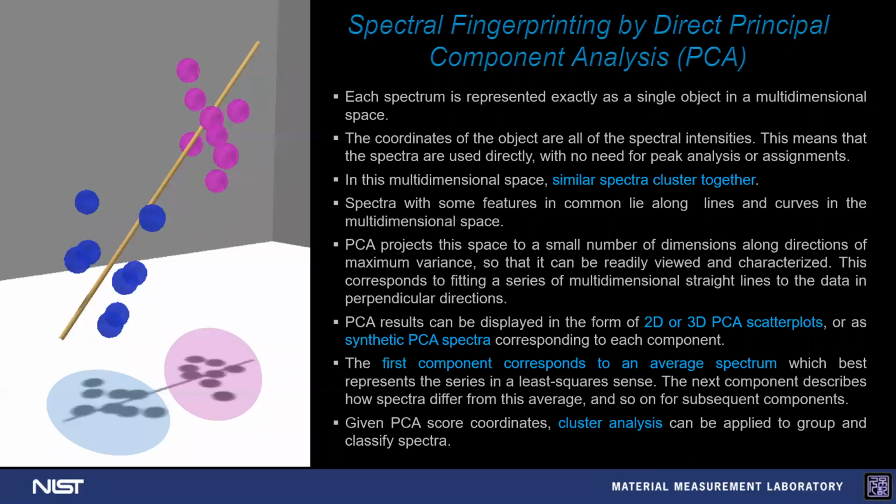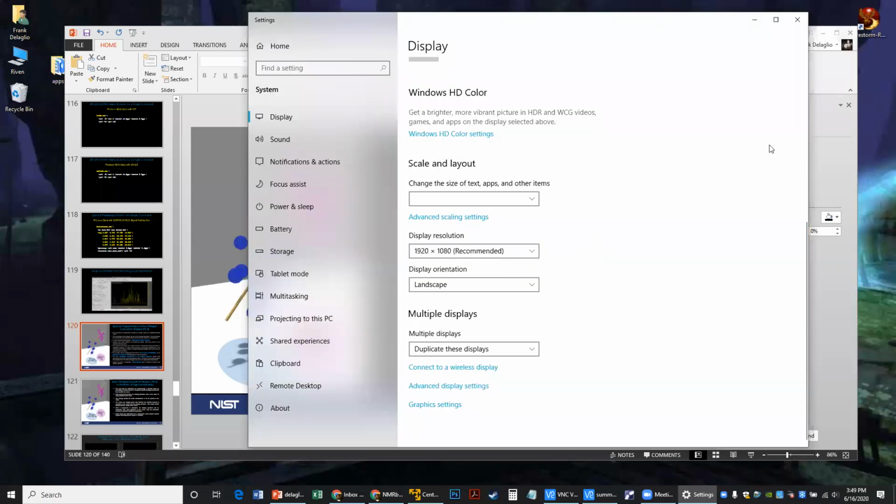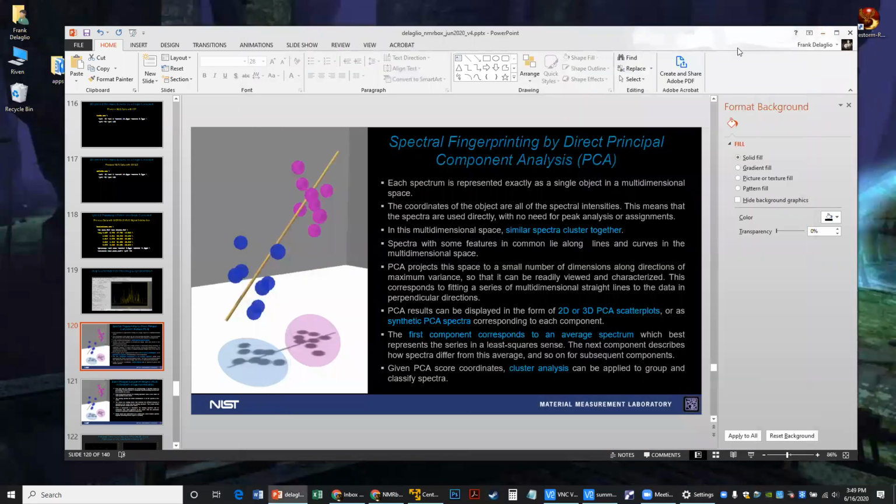So Frank, one question. You mentioned doing the trial processing before we get to the IST, let's say. Do you advise that as the pathway, even if I have a 4D data set? Yes, absolutely, I do. And I will explain why in a bit, and demonstrate. 4D is a perfect example.